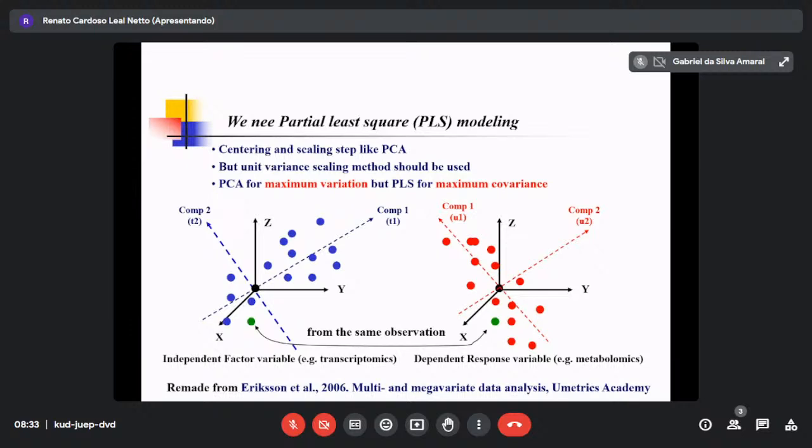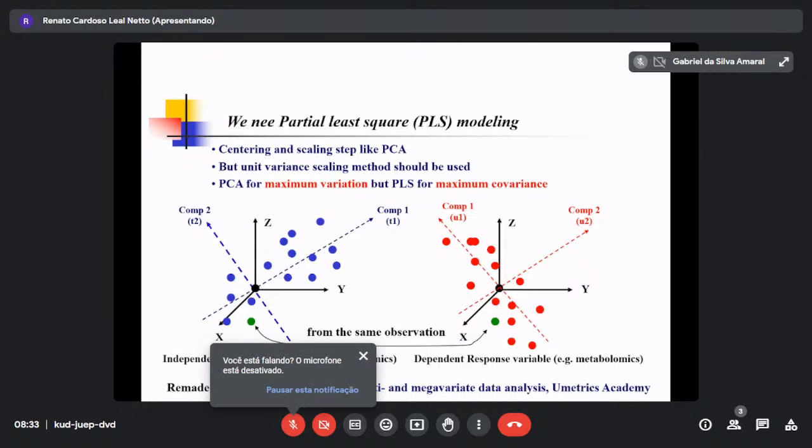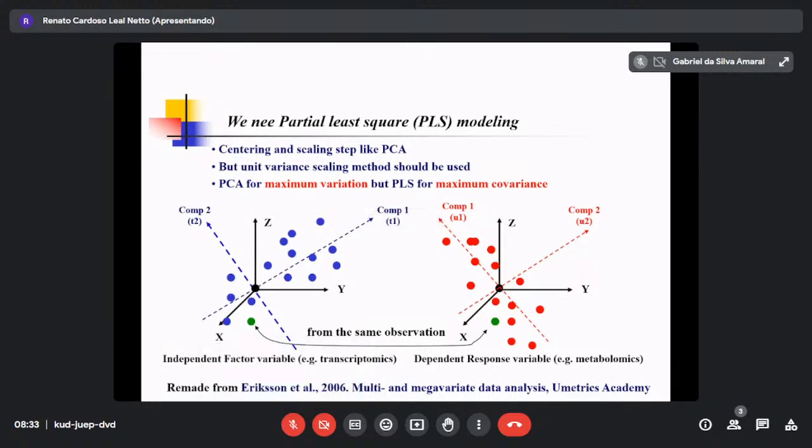Thank you for coming. Today I want to continue the leftover of the statistical qualitative analysis of tomato. Yesterday, I mostly focused on principal component analysis. Hopefully you understand the basics of principal component analysis. Most multivariate data analysis is really similar to principal component analysis.